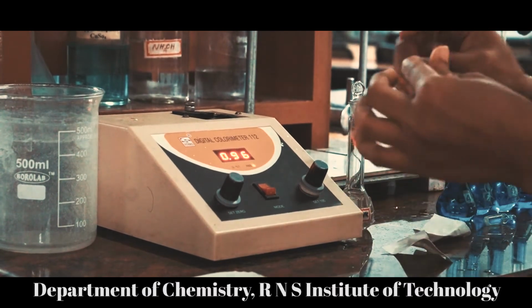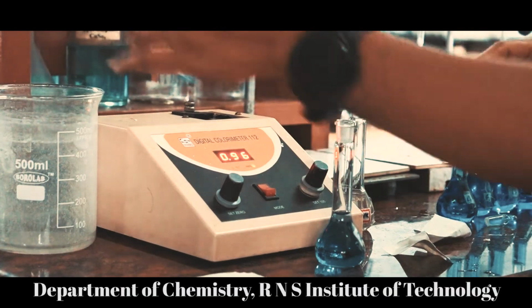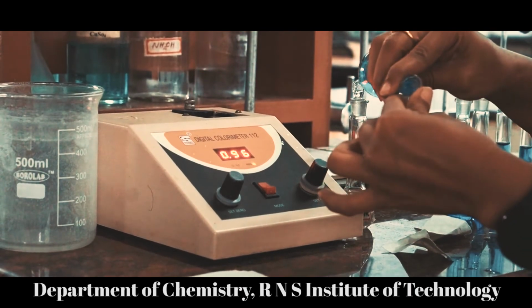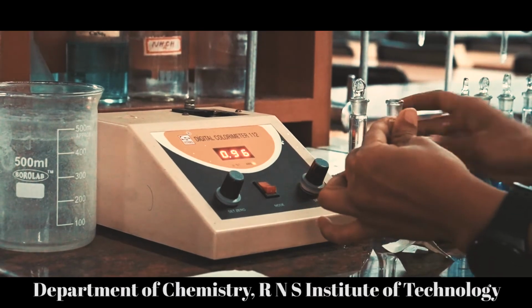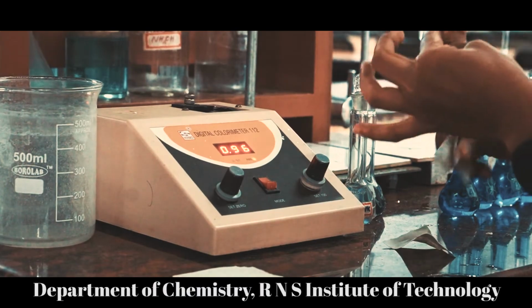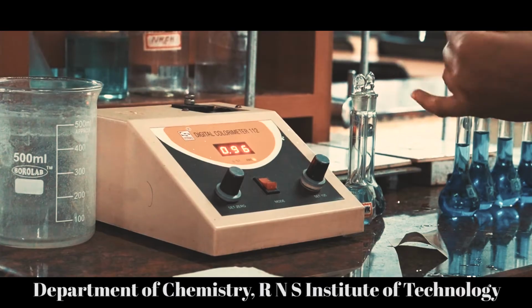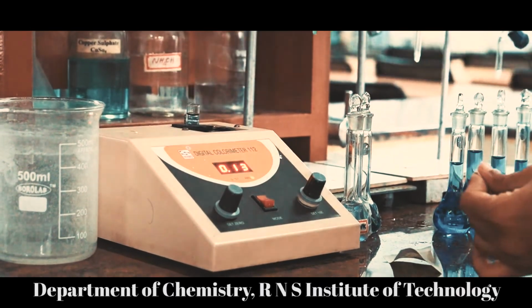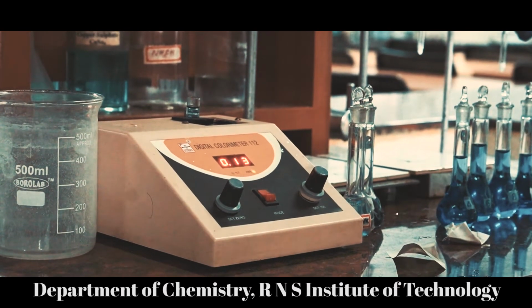Flask number 2, rinse the cuvette with the flask 2 solution. Fill it with the same solution. Note down the absorbance of flask 2 solution.